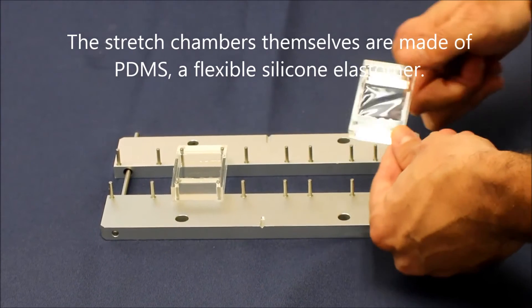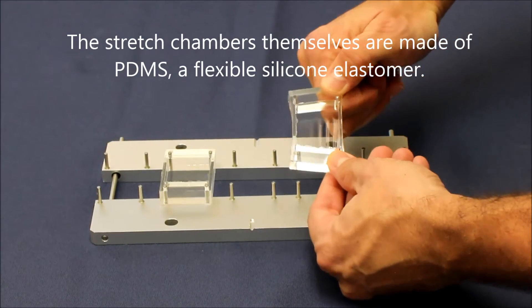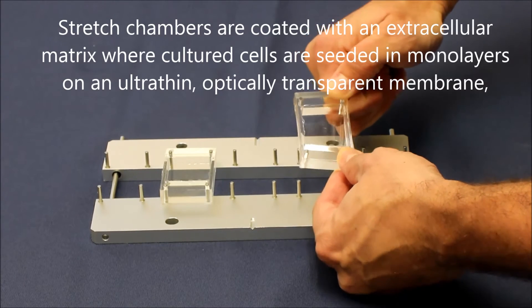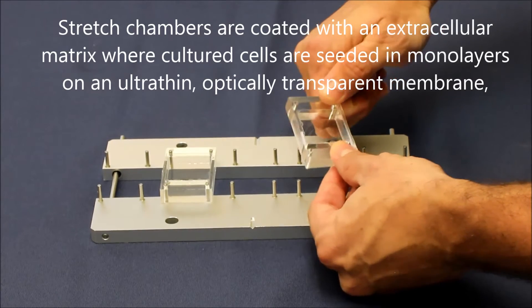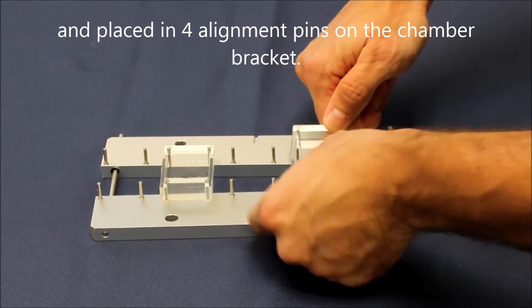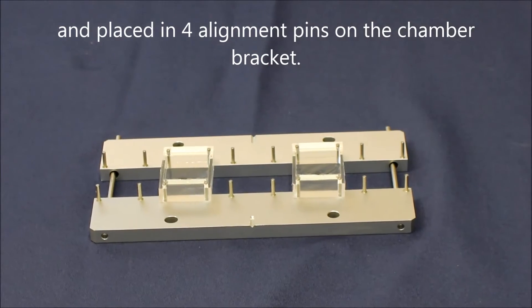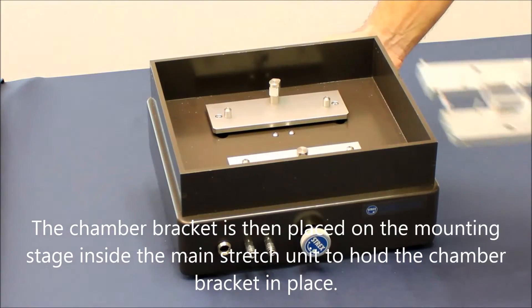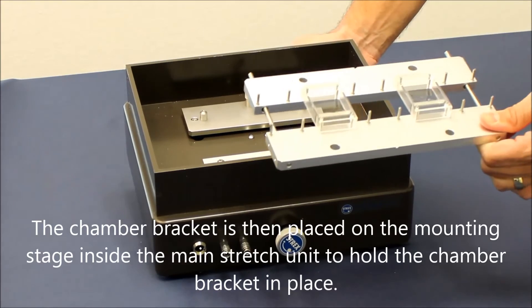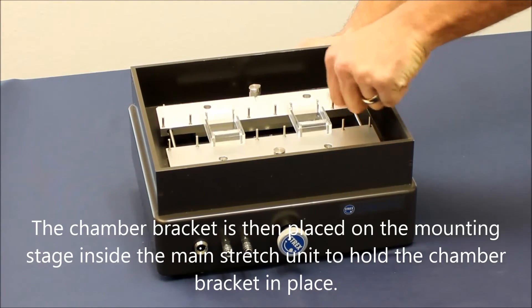The stretch chambers themselves are made of PDMS, a flexible silicone elastomer. Stretch chambers are coated with an extracellular matrix where cultured cells are seeded in monolayers on an ultra-thin, optically transparent membrane and placed in four alignment pins on the chamber bracket. The chamber bracket is then placed on the mounting stage inside the main stretch unit to hold the chamber bracket in place.